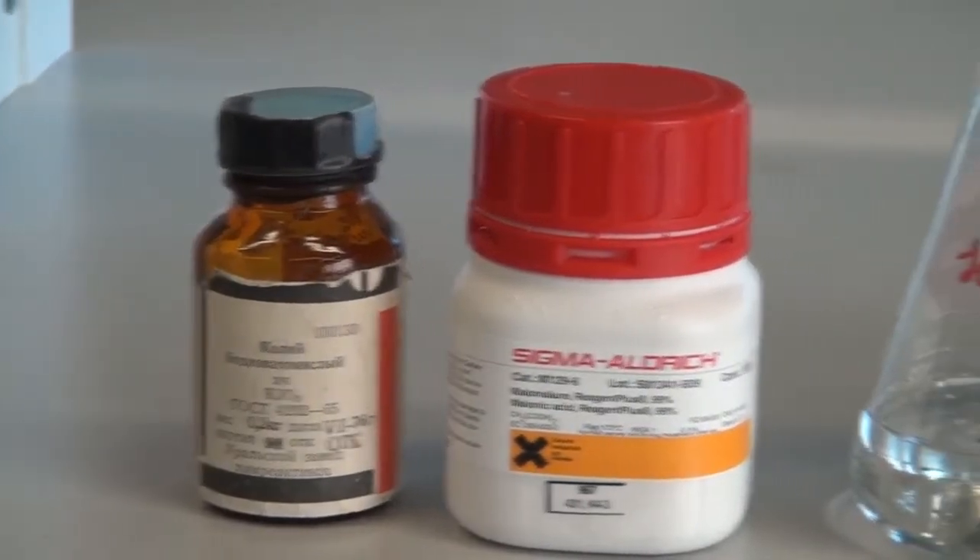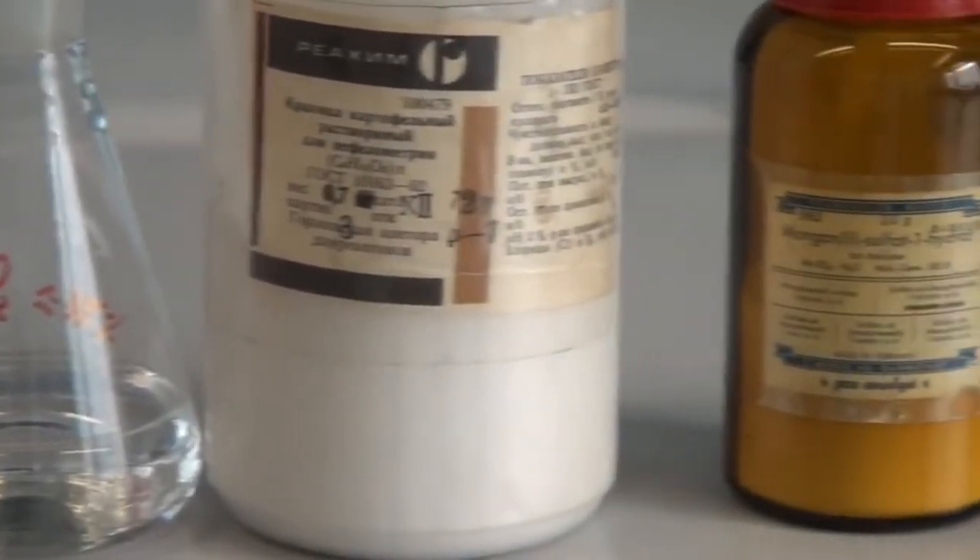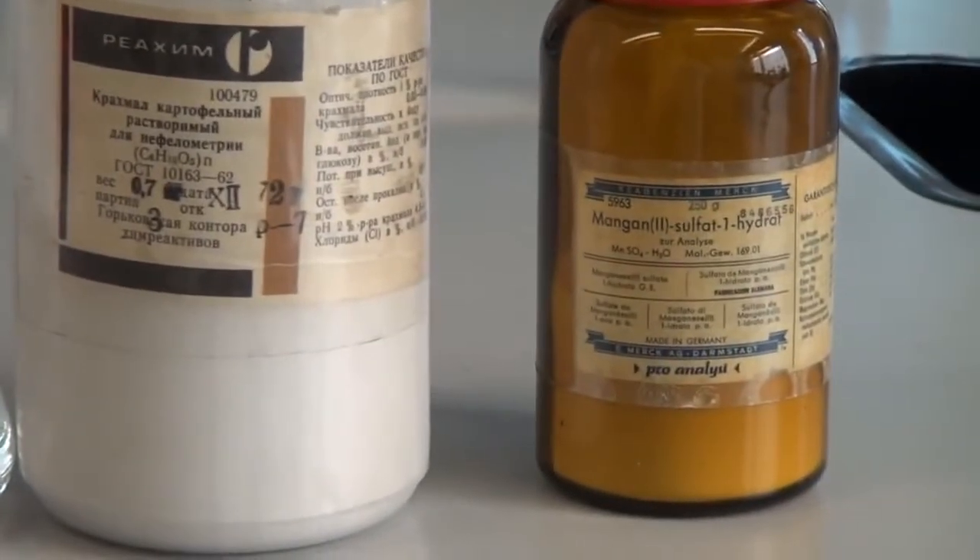For this experiment we will need potassium iodate, malonic acid, 30% hydrogen peroxide, potato starch, and manganese sulfate.